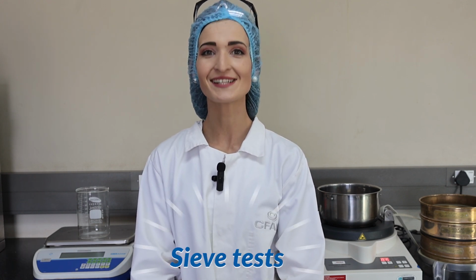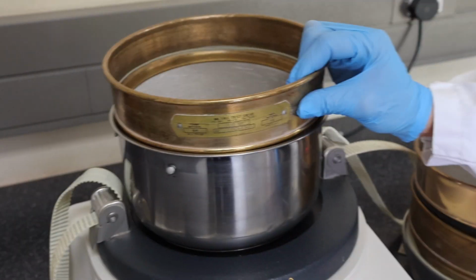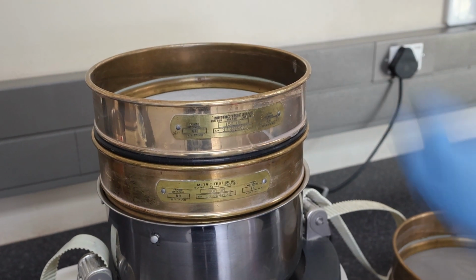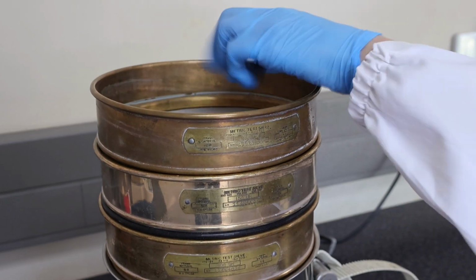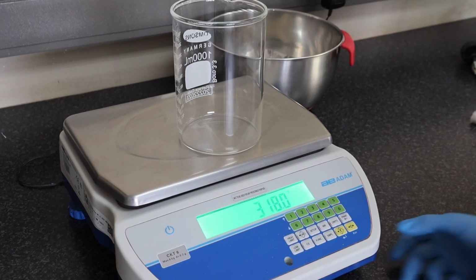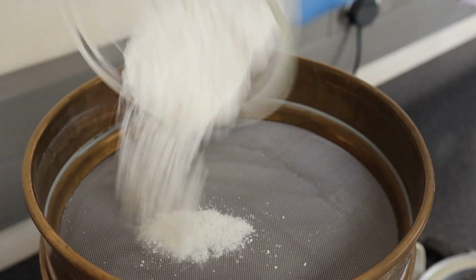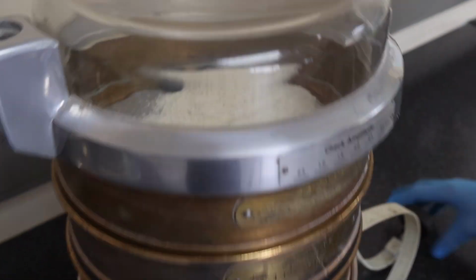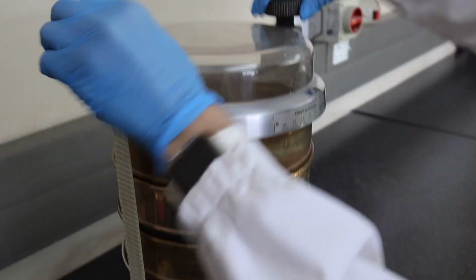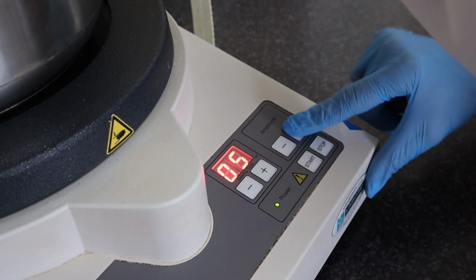Today we are demonstrating sieve tests. In our lab, we conduct sieve tests to assess particle size distribution, enhancing process efficiency, and to determine the functional properties. This process involves arranging sieves from largest to smallest mesh size, weighing a sample and placing it on the top sieve, using a sieve shaker to agitate the stack for a set time, recording the weight retained on each sieve, calculating the percentage of the total sample weight on each sieve.